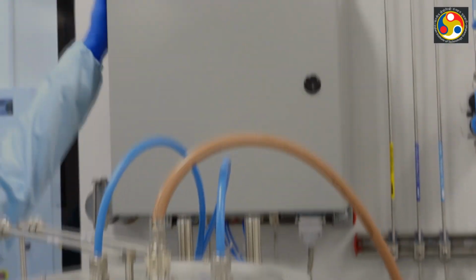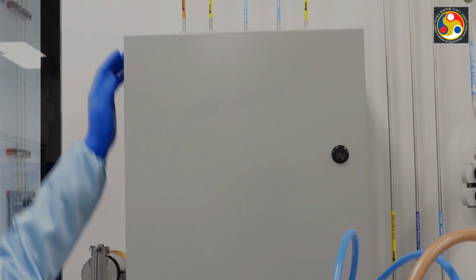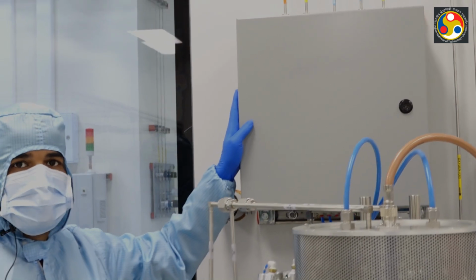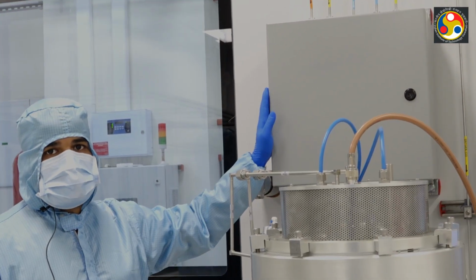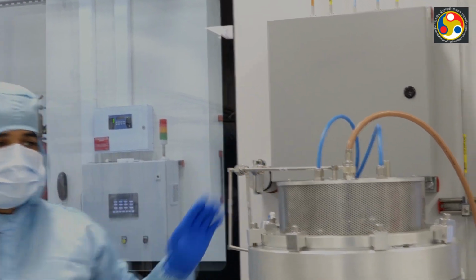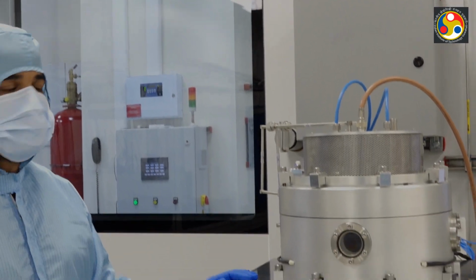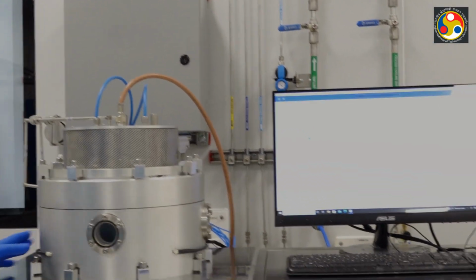The gas supply lines and mass flow controllers are inside this. So gases are coming from the gas bank, and this is the control for the individual gases. For each gas we have one mass flow controller, and that mass flow controller is controlled by this PC. This machine has three basic components. One is gas supply, one is this main machine, and another one is chiller.